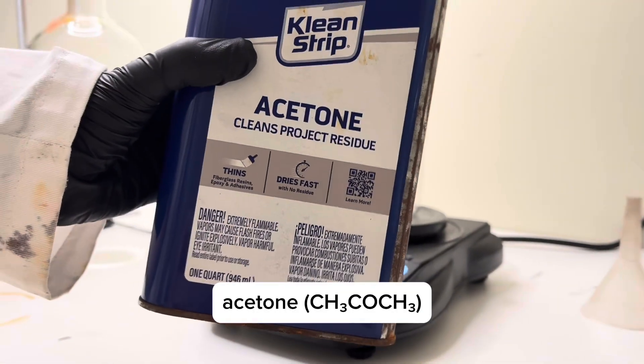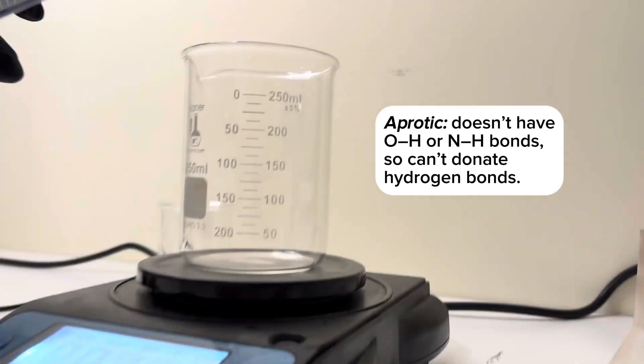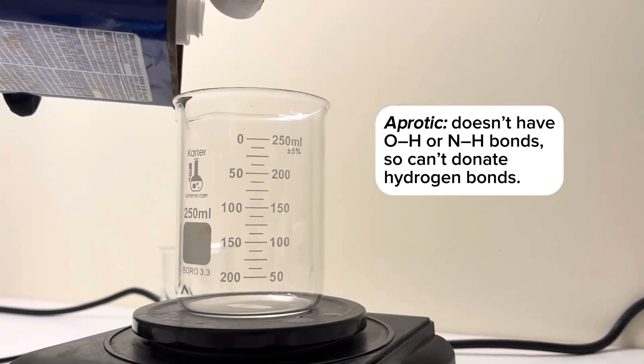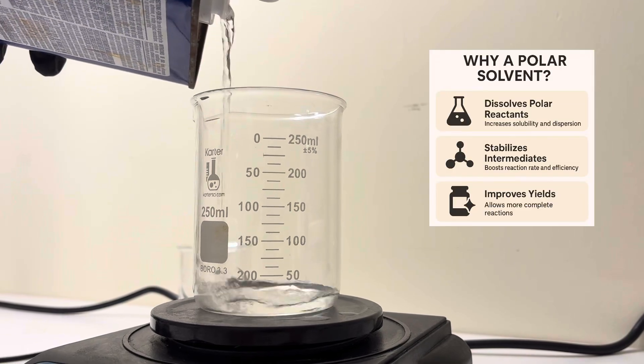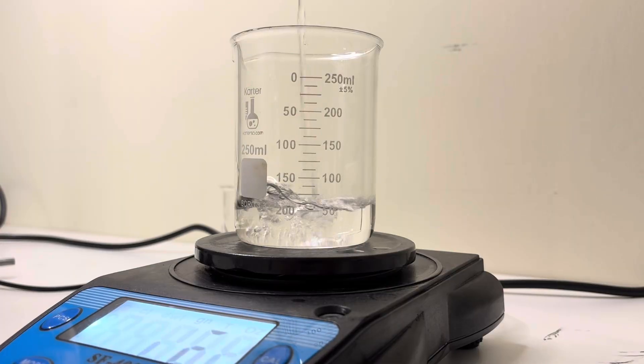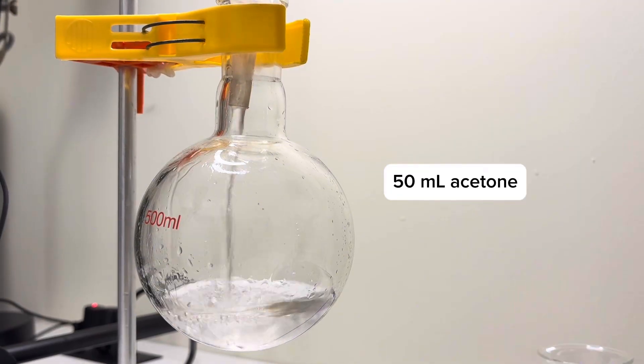Here's acetone for the solvent. It's aprotic so it doesn't donate hydrogen bonds and interfere. And it's polar, which boosts solubility, mixing, and reaction control. I'll use 50 milliliters.